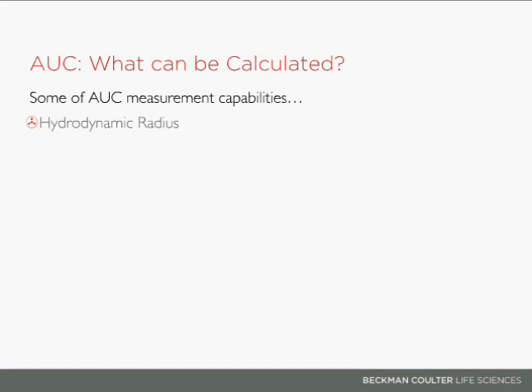You can quickly assess sample purity or heterogeneity. A popular method to do this is by either looking at just the sedimentation coefficients, which vary rapidly with changing hydrodynamic radius, or by plotting sedimentation coefficient versus diffusional coefficient. This is even better and has nearly angstrom resolution at different species in solution.